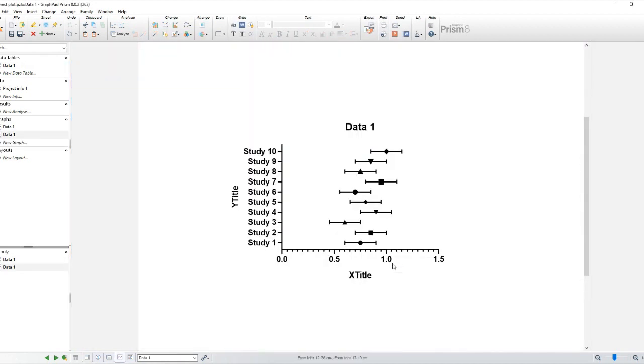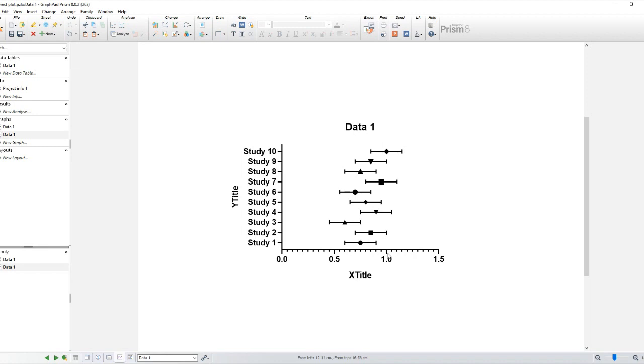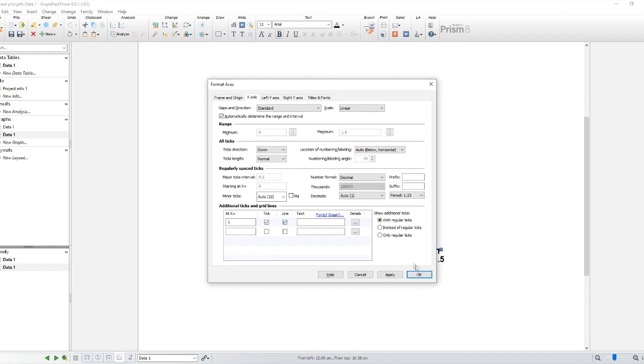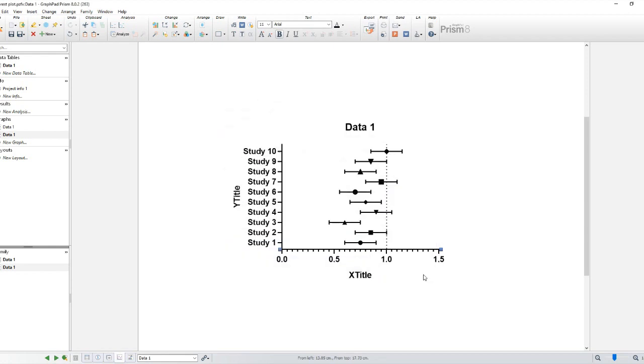To add a vertical line on the 1, double click on the x-axis to open the Format Axis dialog. In the Additional Ticks and Grid Lines section, set the coordinate on the axis where the tick or line should appear. Check the box to show either a tick or a grid line. If the coordinate is at a location where there already is a regular number or label, the label you enter in the Additional Ticks section is shown and the regular label will be hidden.